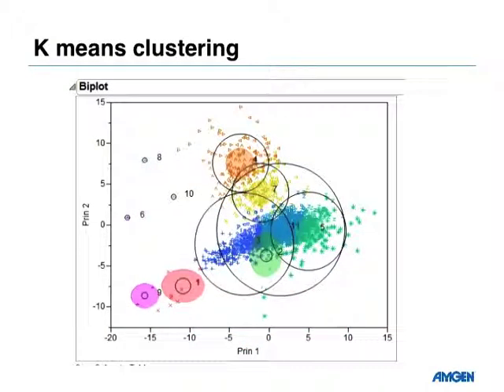Another thing that we've used, and to me a little more informative, is k-means clustering, where you have to say how many different clusters, how many different populations of things, have I produced by my treatment? Here we've selected 11 different clusters. It starts off by taking 11 different things that look fairly random and far apart, and sets those as the centers of clusters. Then it tries to minimize the differences within these clusters, so you end up with different populations that are similar to each other.